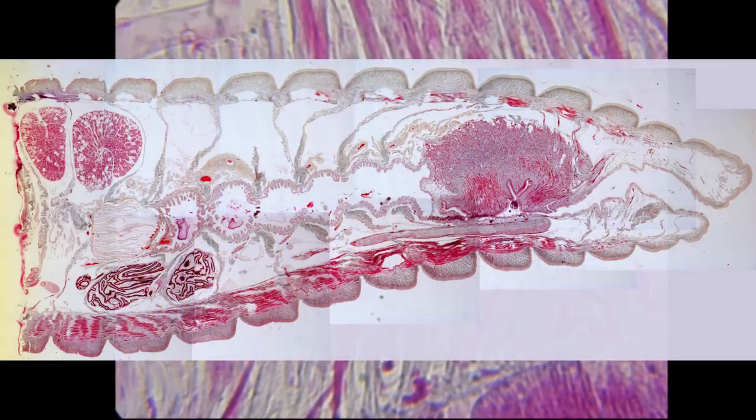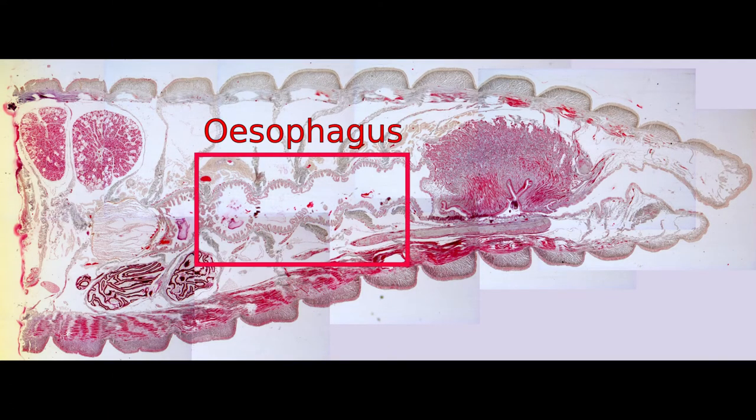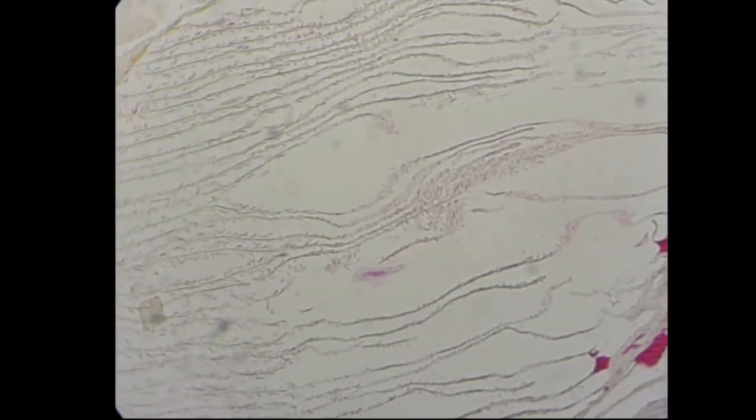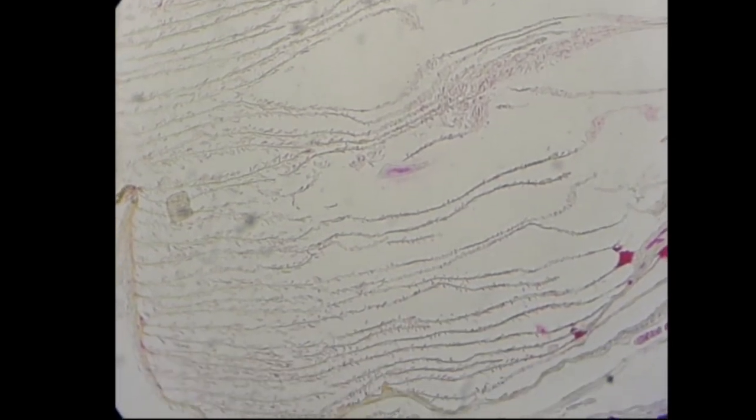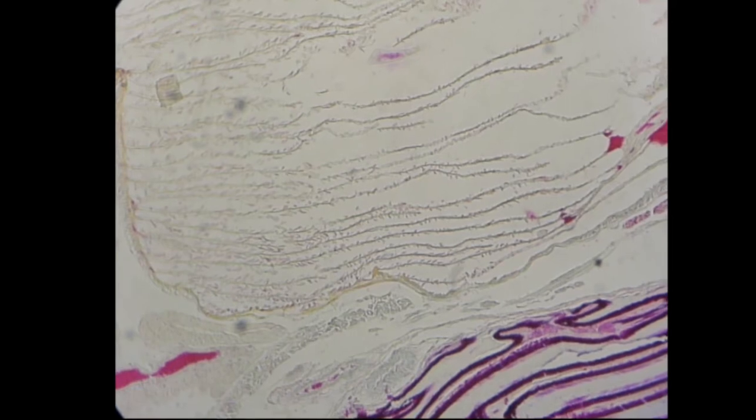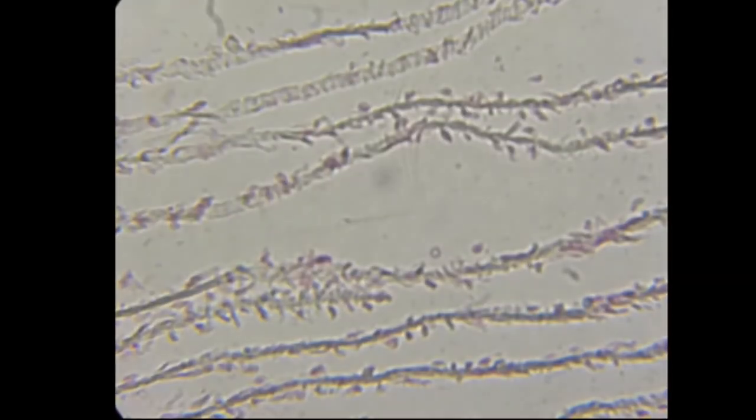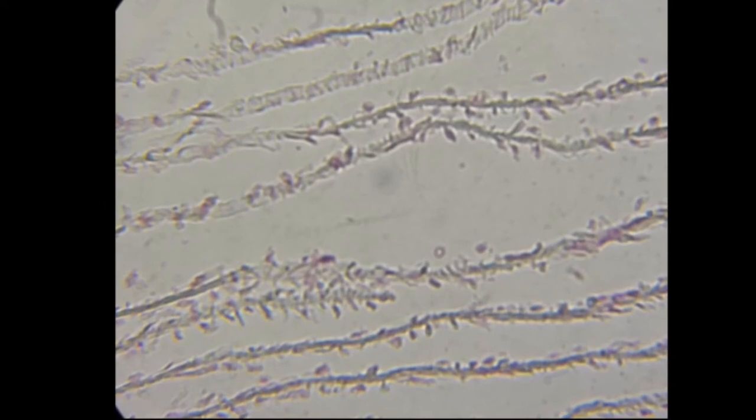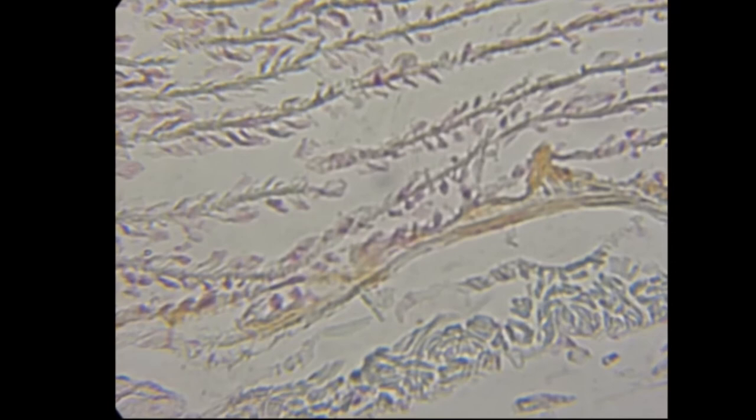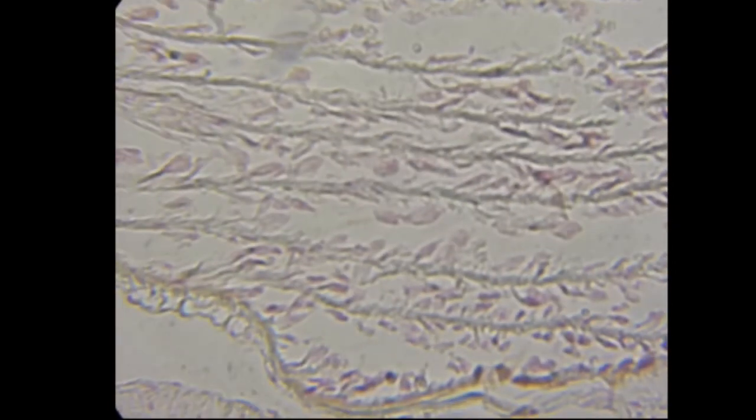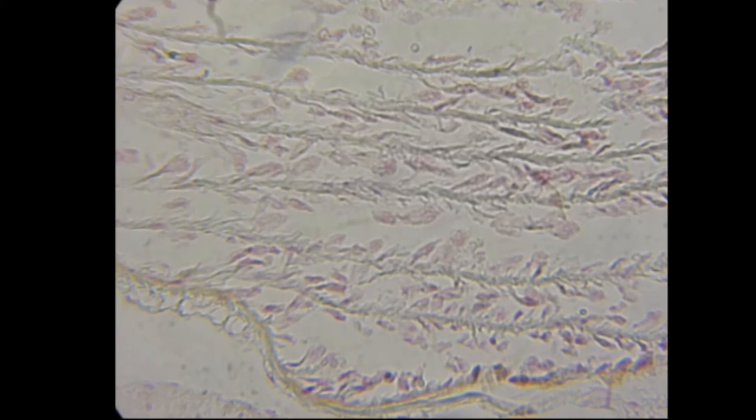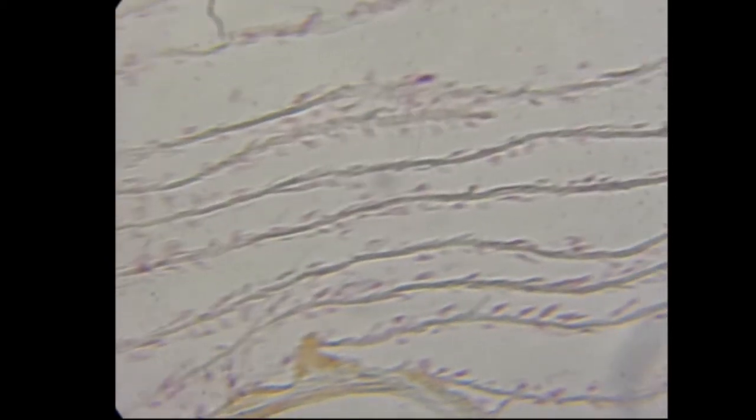Finally, the last structure we can see on this section is the esophagus. This will eventually lead to the earthworm's crop and gizzard, which are not on this section. However, we can appreciate another rather unique organ of earthworms. This outpouching of the esophagus with numerous folds of tissue is the calciferous gland. This gland secretes calcium carbonate particles coated in mucus. Each of the folds you can see is composed of two layers of secretory epithelium surrounding a central blood vessel. The calciferous gland's function is to secrete excess calcium from the earthworm's blood. It's excreted in the form of calcium carbonate, which forms calcite crystals in the gut and cannot be reabsorbed on this second passage of the gastrointestinal tract.